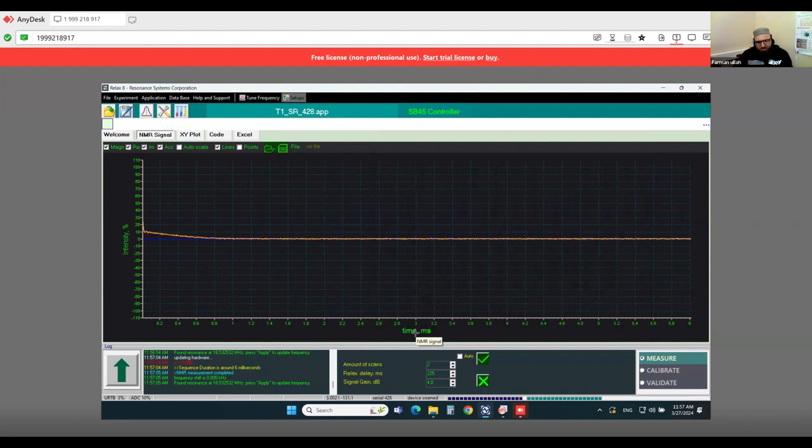So it depends, because this is chocolate. We have already some FFC results of this chocolate, where we also saw some noise. I applied different parameters. I increased the number of scans for this chocolate, but we still have some noise.